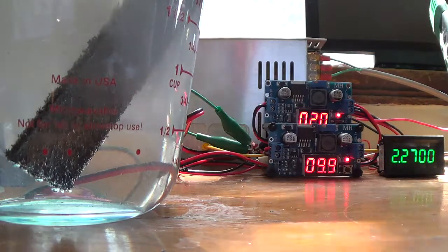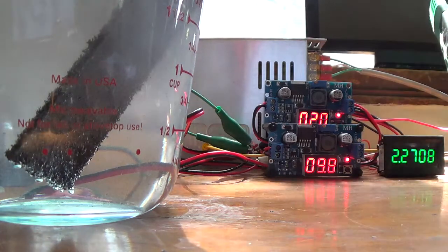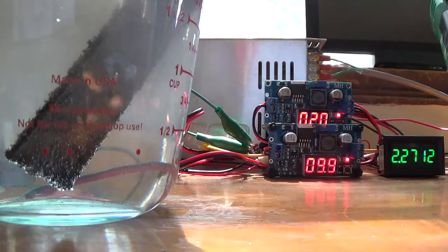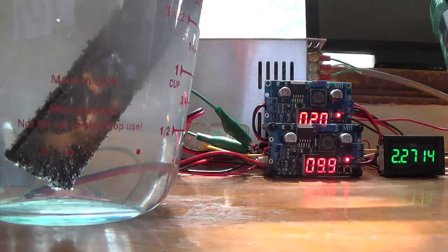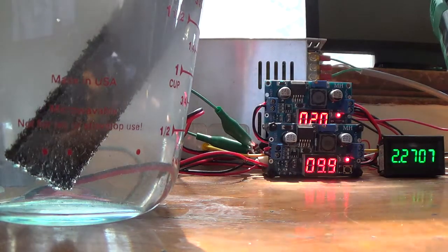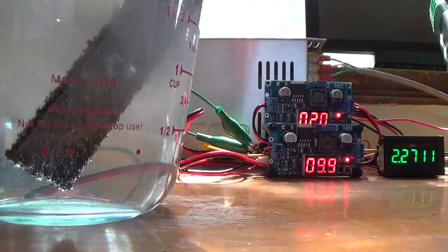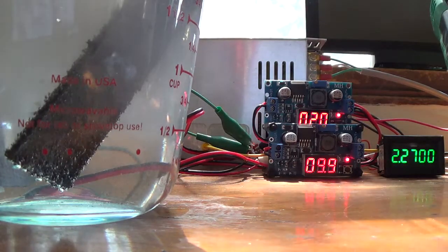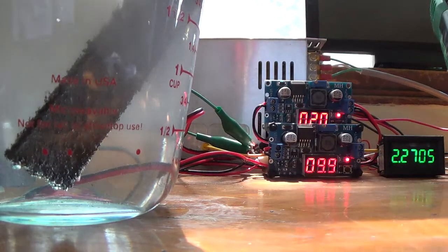The amount of current during the 2 volt loading process started off at approximately 10 milliamps, dropped to 2, and now at the 10 volt process we're pulling about 2.25 amps, and that was approximately what we expected to see. So far, no surprises. The process is going at a much more sedate pace, which is again what we'd expect, and so far I'm somewhat happier with what I'm seeing.